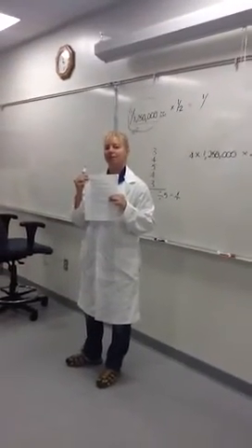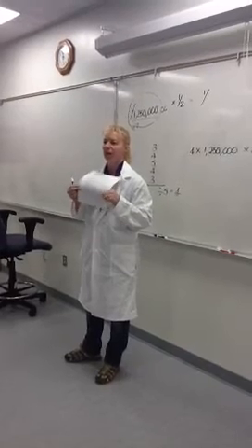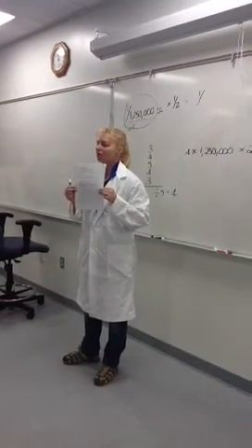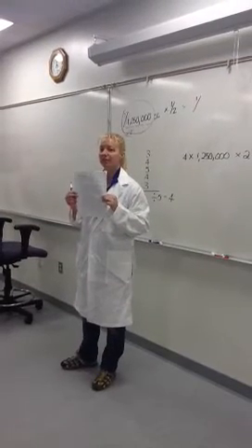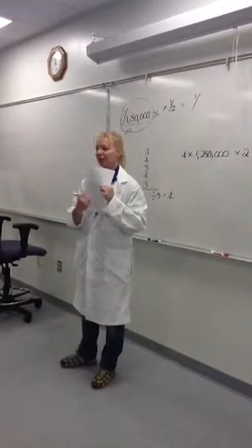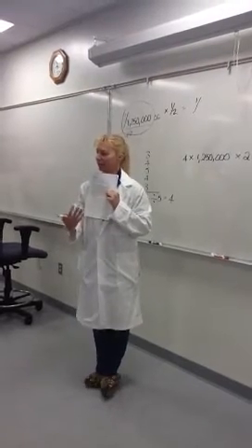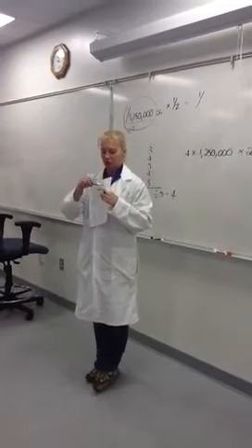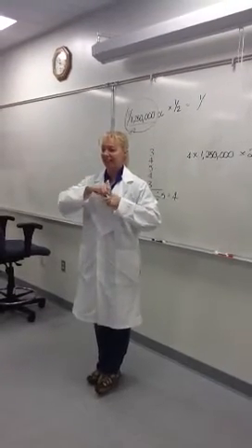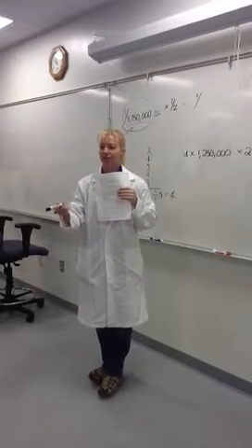Okay. And that's already done for you in here. When you go onto the website for it, there is something that you can play with where you enter in stuff and it will give you a chart showing the logarithmic growth, because this is going to tell you how many organisms are in this sample at this given time. The limit of both of these techniques is those organisms are still alive.